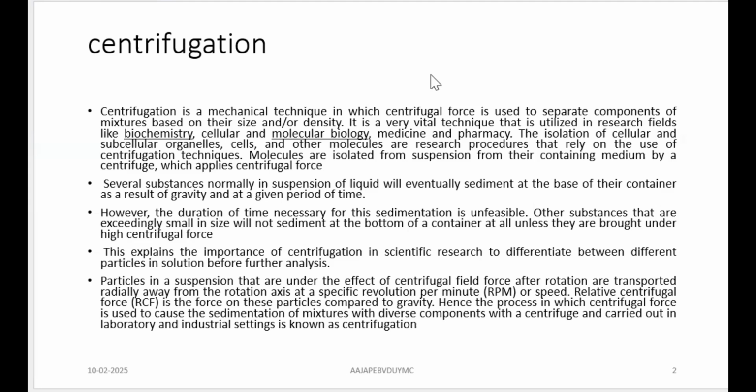So if you want to completely remove all that debris from water, solubilized particles you cannot separate by centrifugation, but suspended particles of smaller size, which won't be settling by gravitational sedimentation, you can separate. We can apply an external force, and that is what we call centrifugal force, right?